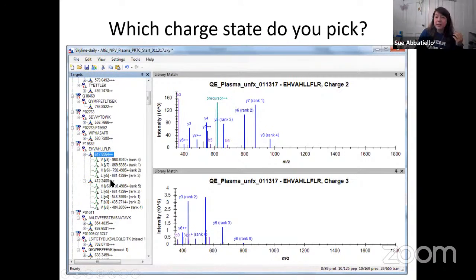And then we've got a bunch of product ions for each one. These were all automatically generated in Skyline by giving it a certain number of criteria, like give me 4 or 5 transitions, give me the 2 charge states. And so that's what we see. Then when the spectral libraries are brought in, we can observe them this way, visualize them plotted. You can have Skyline label all the peaks that are observed. So these were already identified by a spectral database search, and then that result from that spectral database search was brought into Skyline.